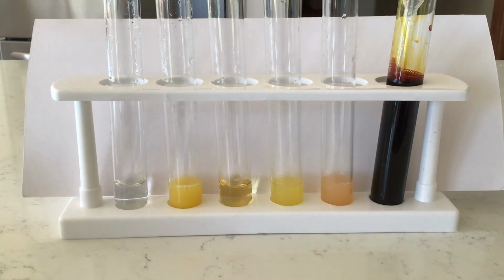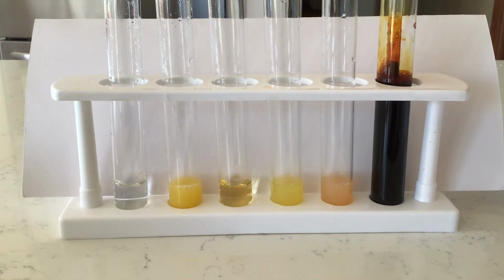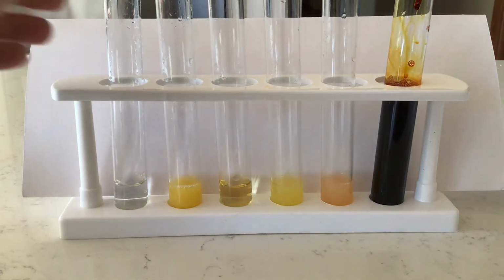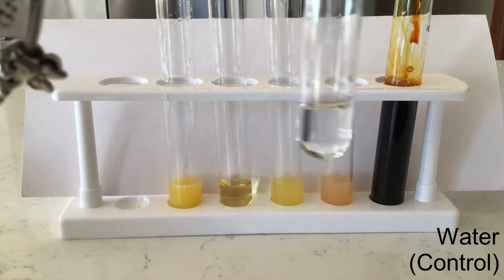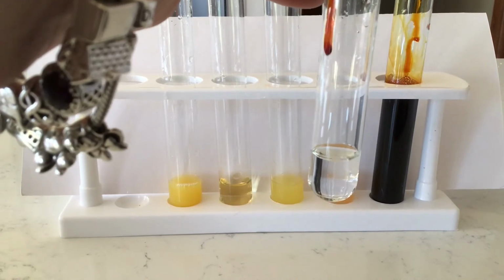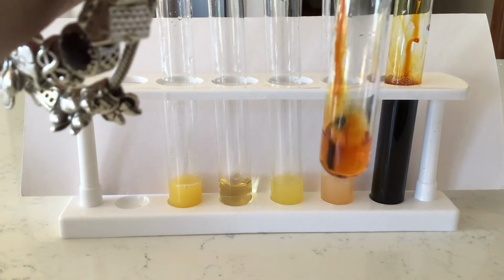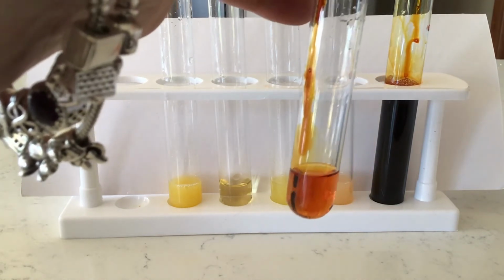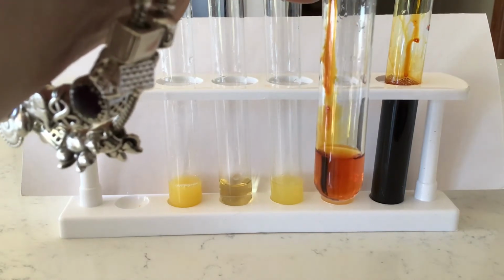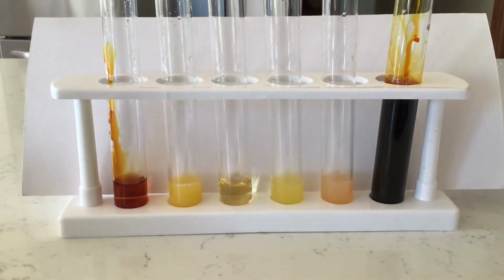So let's get started. Now the goal for me is to not get iodine on the side of the test tube. If I get iodine on the side of the test tube, that drop might not count because it doesn't go all the way into solution. So first I'm going to do water, and you'll see there was already a drop on the side. However, this one we're not worried about counting drops. I just want you to see that this is going to change the solution color because there is no vitamin C within it. Okay? So that is our control, that is water.